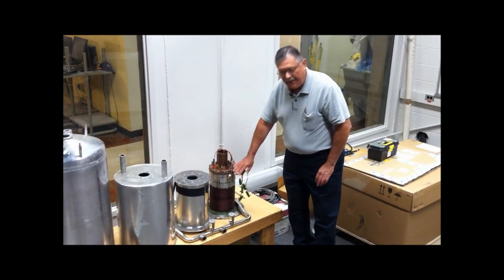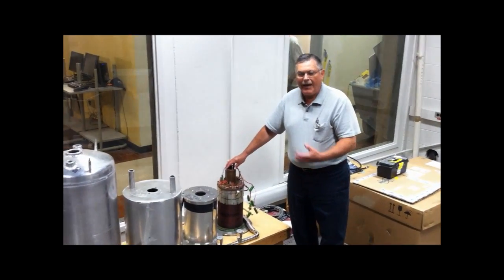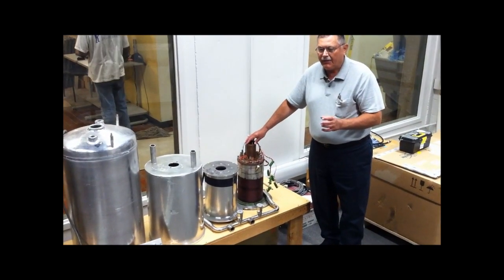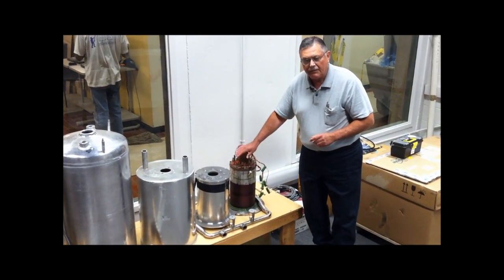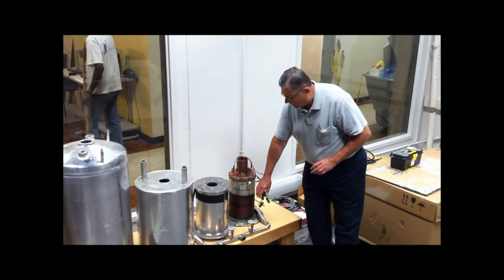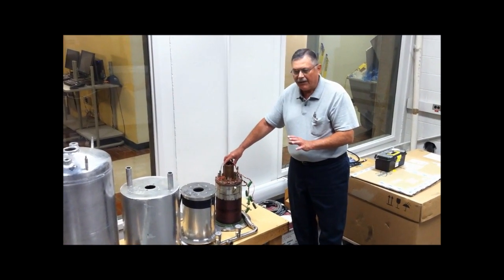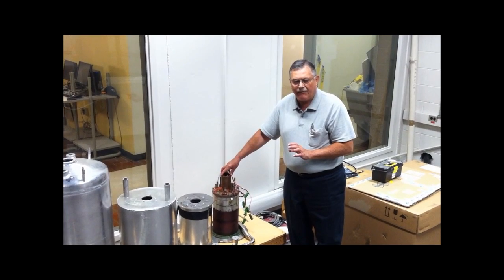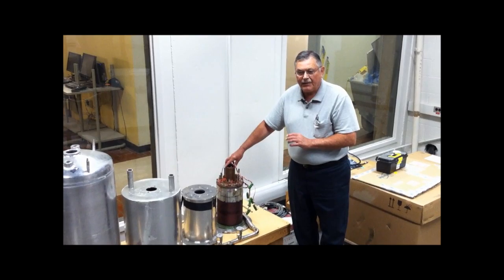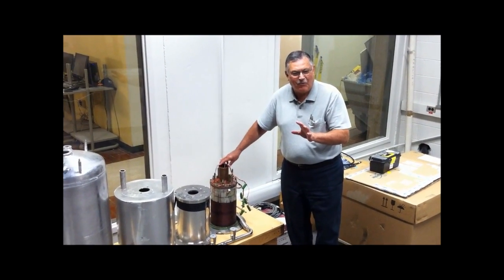At liquid helium temperatures, this wire has virtually no resistance. So when you bring a magnet to field, you have a DC power supply and you can slowly bleed current into these coils. Once you get to the correct value for the current, power, and capability of those coils, you disconnect. And in theory, as long as you keep the magnet filled with liquid helium, the magnet will exist basically forever, or until you run into a helium drainage at some point.